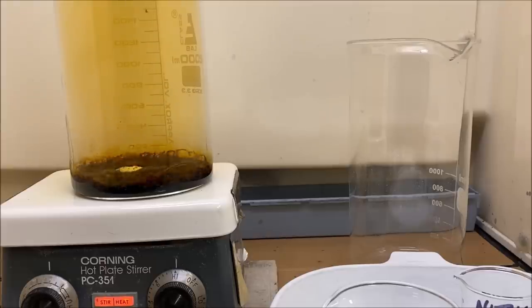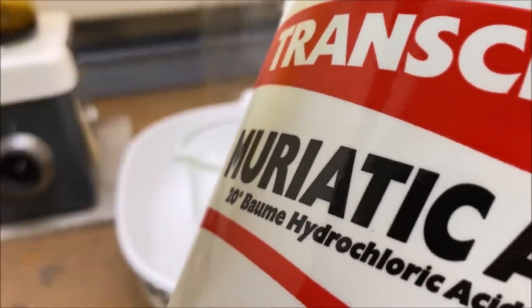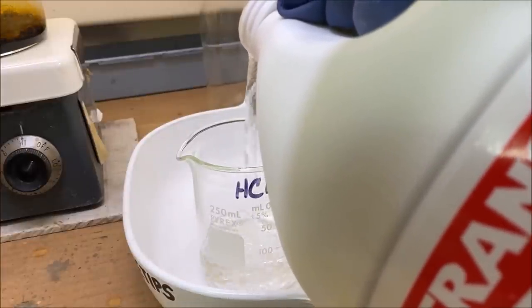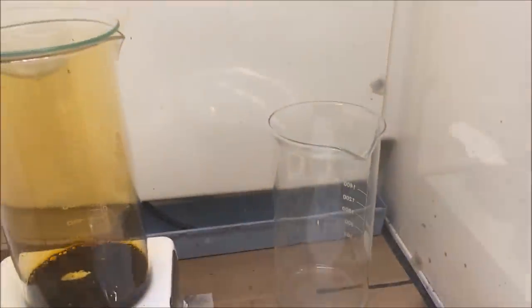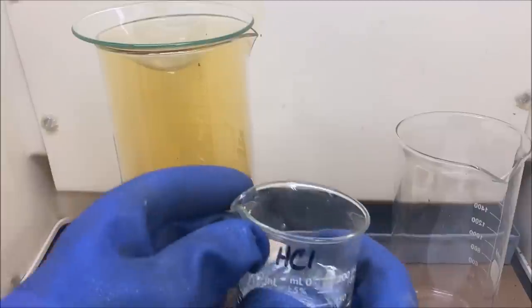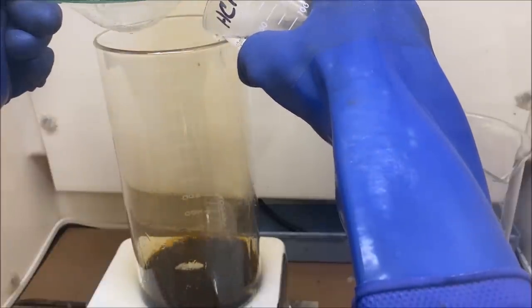Our solution has become dehydrated, so what we're going to do is measure out a little bit of hydrochloric acid into this beaker, about 100 milliliters. And now what we'll do is slowly add this in to our platinum. Try to rehydrate this reaction. Carefully, carefully.